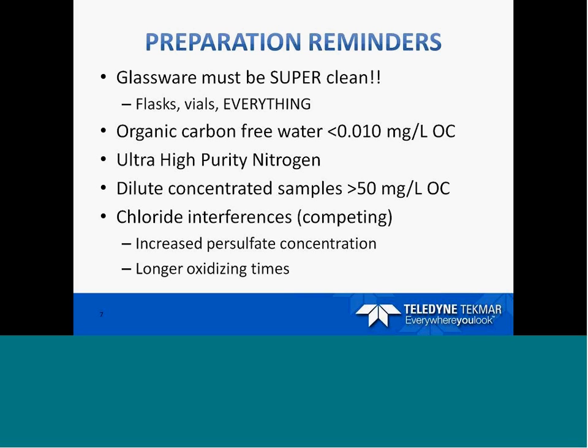You can increase the persulfate concentration. So if you imagine that you've got your reagent in there and these little chloride ions are all moving around and they're competing for persulfate as well as the sample. So either increase that persulfate concentration, or you may need to use a longer oxidizing time. So there are extra steps that you can do.